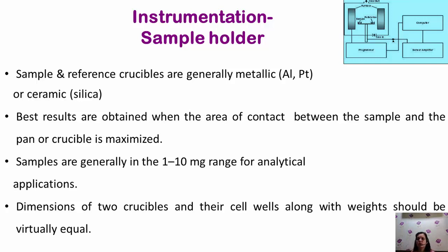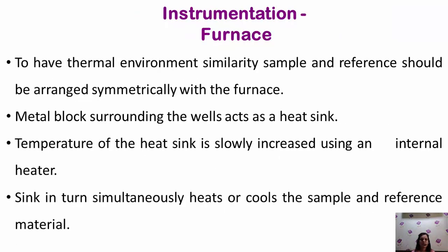The dimensions of the two crucibles where you are putting the sample should be considered with respect to the cell well. I am not saying cell wall, it is cell well, the depth of the container and the amount of sample taken inside the container. Furnace, the second component: you have to take care that your furnace provides the same environment for sample and reference, which are arranged symmetrically within the furnace.